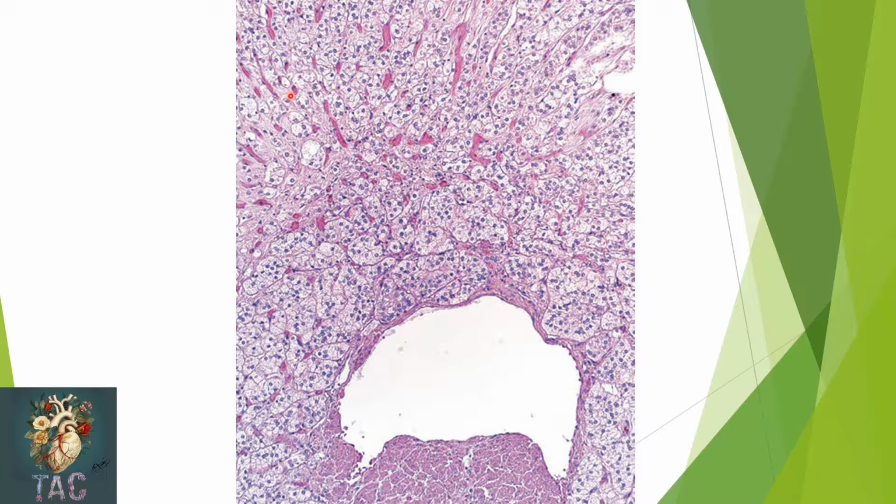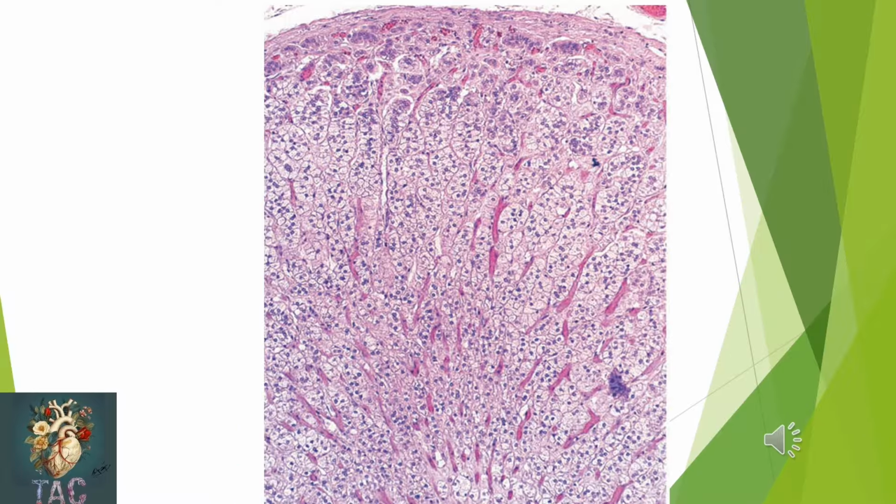So this area is the zona glomerulosa, then the zona fasciculata, then the zona reticularis, and here you can see the medulla of the adrenal gland. So the section taken through the cortex, outer is the capsule of the suprarenal or adrenal gland. Then the next area is the zona glomerulosa, in which you can see ovoid or curved masses of the cells of the zona glomerulosa.